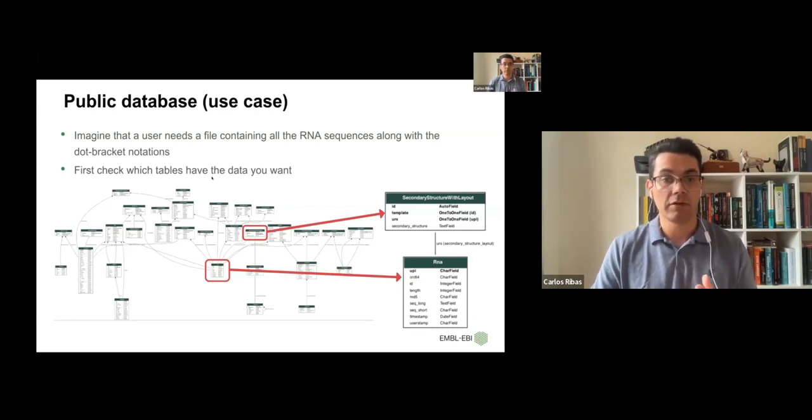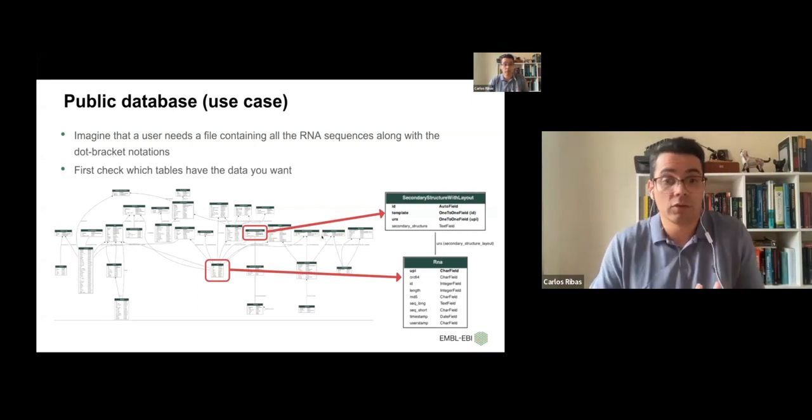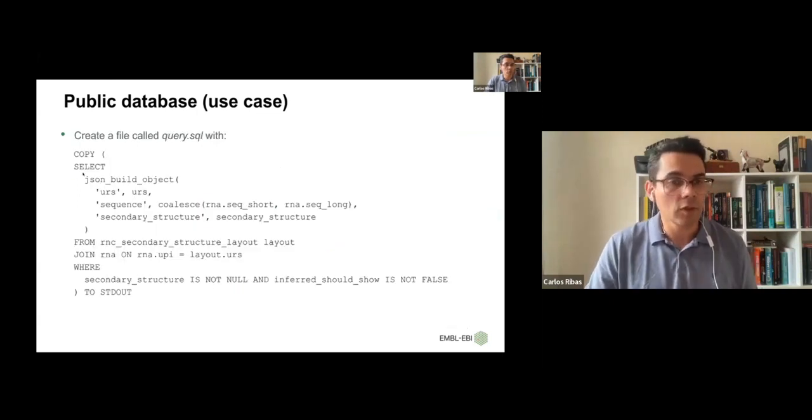And then you can, for example, try to find the data on this diagram if you zoom in and out, or you can just connect to this database and run some selects. Or you can also send us a message saying, listen, I would like to export this kind of data, where can I find this information, and we will help you. But then you can just, for example, run this select command to export this data.